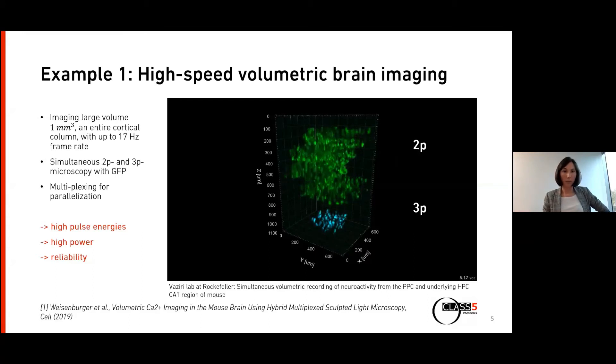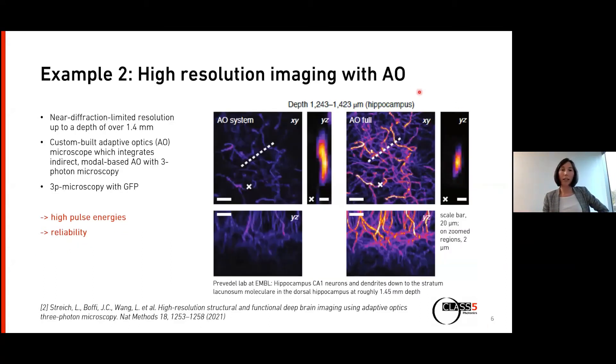The second example is about imaging at large depths with very high resolution — a recent result from a demo at EMBL in Heidelberg. Three-photon microscopy is still limited by optical aberrations; going really deep in tissue introduces inhomogeneities and motion artifacts that decrease resolution below one millimeter. Previously, large volumes could only be imaged at a cellular resolution, resolving single neurons but not the fine structures within the brain.